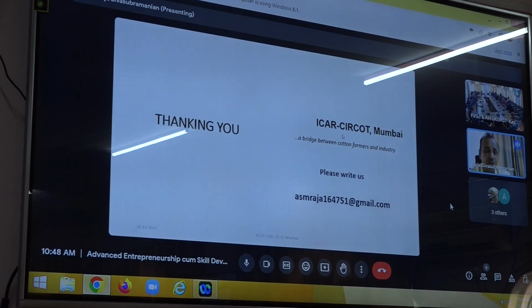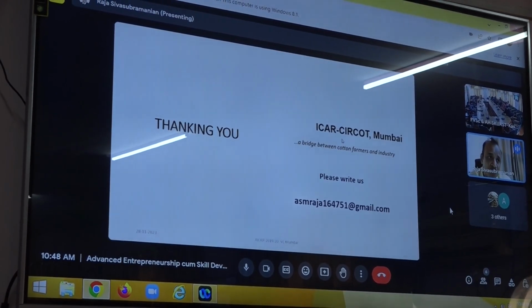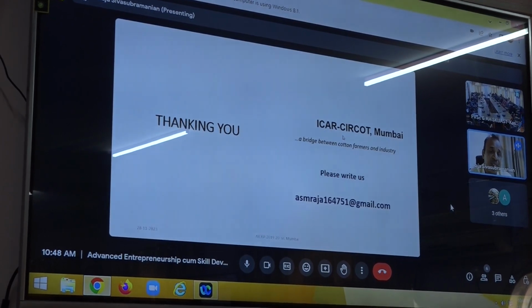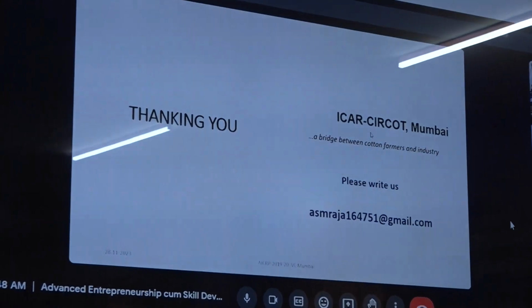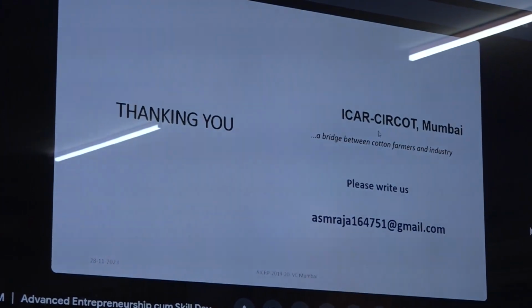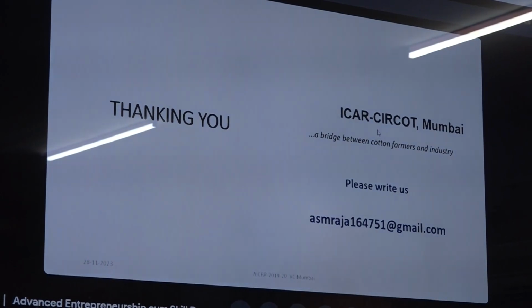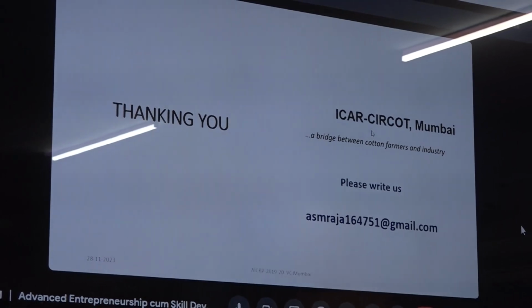You remember, we have to do the preliminary analysis to find out qualitative analysis like burning test, microscopic test, and staining test. Followed by that, you have to remove whatever residues, meaning finishing chemicals, present on the fabric, and then you can decide whether you want to dissolve the Pashmina portion or the other portion. So use this method, then at the end of the experiment you will find out completely what the Pashmina content in your fabric is and the content of other fiber portions.